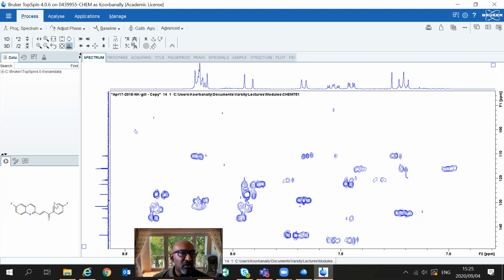I don't know how to tell between the carbons and hydrogens on that double bond either. I know all these protons and carbons on this ring, but I don't know where this carbon here sits. I don't know much about that, or that. This here, there are some questions, and that there are some questions. So let's see if I can use my HMBC to answer all those questions and come up with a good approximation of what my structure is and some good evidence of what my structure is.